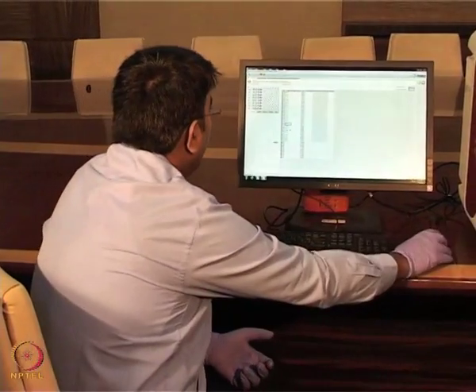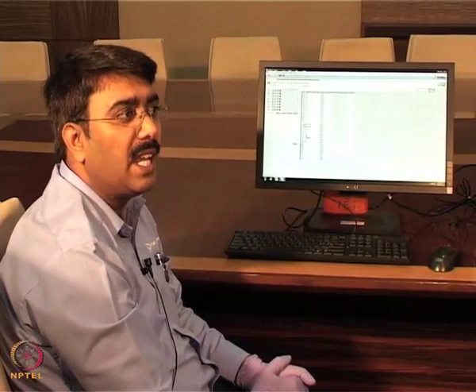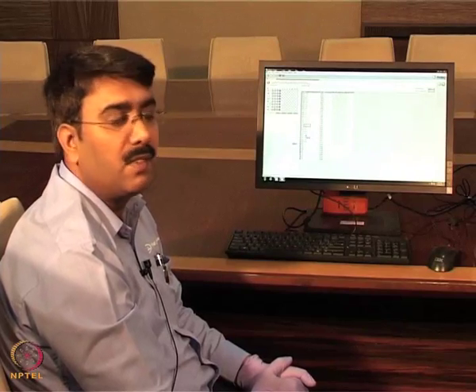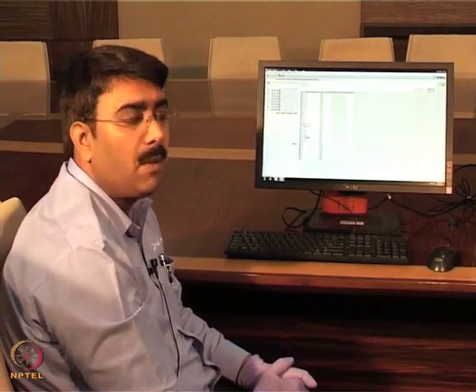Here, as I mentioned, we can use any kind of buffer. In this experiment I am using a PBS buffer with additives like 0.1% BSA, as well as a surfactant, 0.02% Tween 20. This composition is in PBS at pH 7.2.